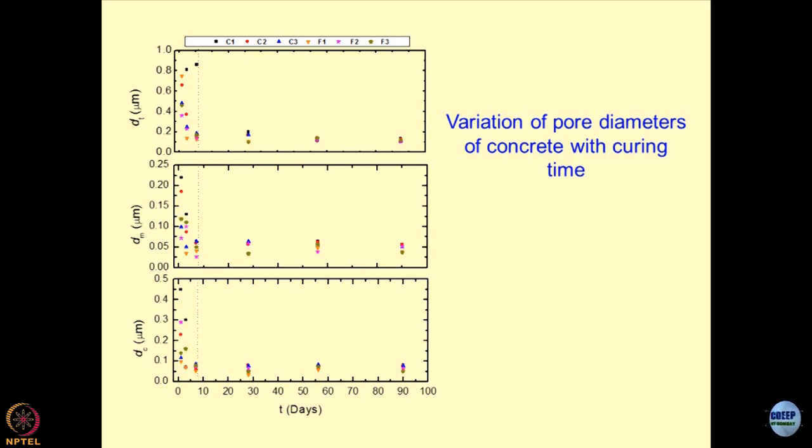They are trying to see how the pore structure changes with time, what type of chemical processes are occurring, and whether these mechanisms can be captured by using MIP and impedance spectroscopy. And nowadays, the most interesting and very latest thing in fashion is nuclear magnetic resonance, NMR, which is being used for obtaining the amount of moisture present in the material at a given time. So, I thought I would share some of these ideas with you, because those of you who will be working in the field of environmental geomechanics would find this discussion very useful and quite contemporary.